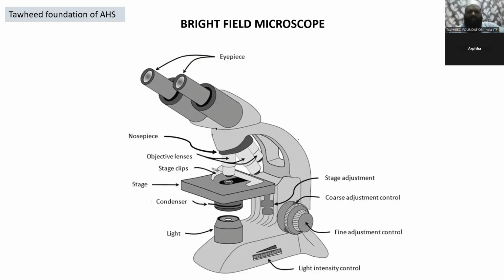A microscope with a high resolution and uses two sets of lens, and this eyepiece can be a single one or double eyepiece with two-dimensional image. 2D image can be observed in this one.